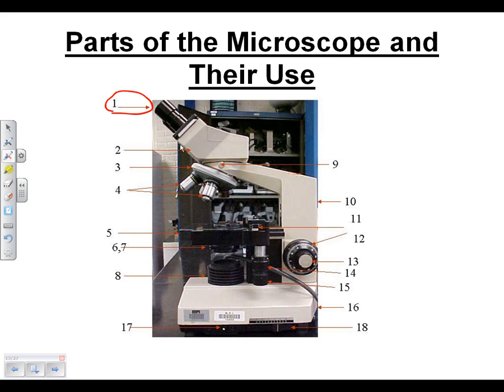So what you do is, whichever ocular doesn't have the adjustment, and usually it's the left one, you close your right eye, focus the microscope with just your left eye open, then close your left eye and look down through the adjustable eyepiece with the right eye, and then you turn the adjustment until the microscope is in focus. And now what you should have is both eyes should be able to see the same image in the same focus, and you should have a lot fewer headaches and life should be a lot better.